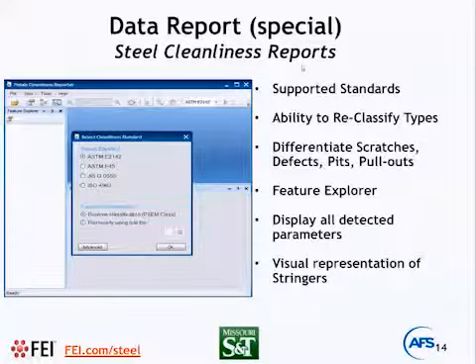So we also realized that at some steel companies and even the users of steel, they would like to know the cleanliness of the steel. If steel is supplied to an automotive company or a medical device company, they would like to know the cleanliness based on some industry standards.